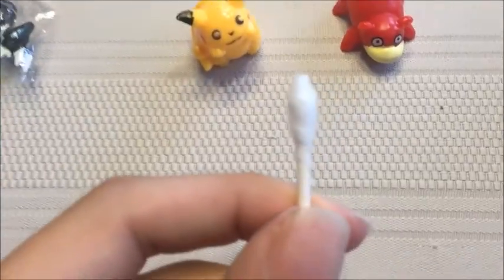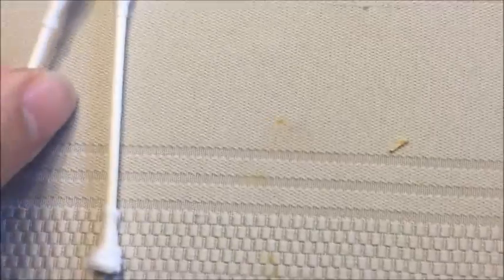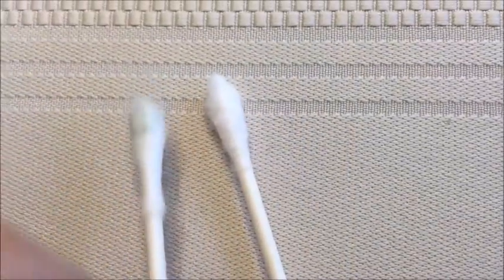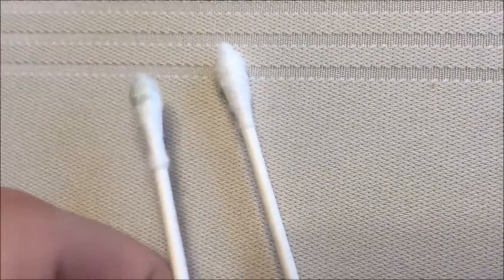Let me get a completely clean Q-tip. You can see the difference that way, because it's really clear. There we go — it kind of looks green on this camera. But yeah, there it is.